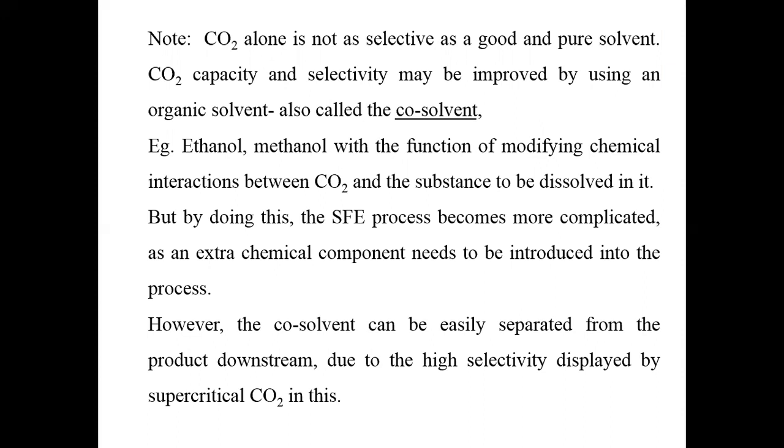CO2 capacity and selectivity may be improved by using an organic solvent, also called a co-solvent, such as ethanol or methanol, with the function of modifying the chemical interaction between CO2 and the substance to be dissolved. But by doing this, the supercritical fluid extraction process becomes more complicated, with an extra chemical component needing to be introduced into the process. However, the co-solvents can be easily separated from the product downstream due to the high selectivity displayed by the supercritical CO2.